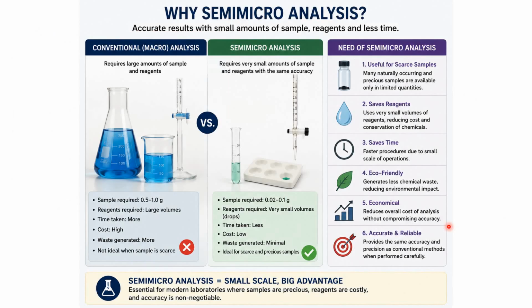Now, why semi-micro analysis? Why is it superior to macro analysis? In semi-micro analysis, the sample required is less, so the reagent required also will be less. Therefore, it is cost effective. Less sample and fewer reagents are required, so economically it is beneficial.